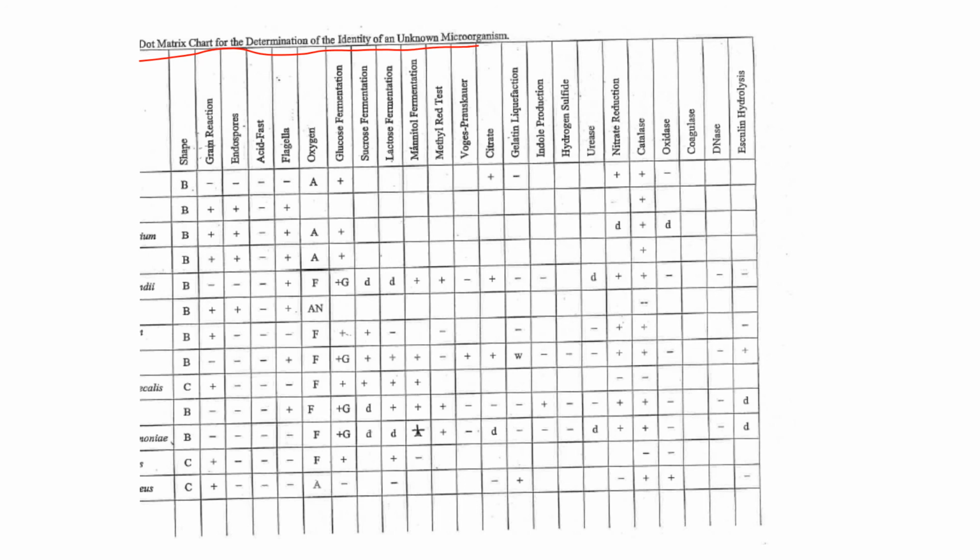This is uploaded onto Eagle, and you would compare your unknown's profile with known profiles. And I'm sorry here, but this has the names of the knowns, and in this copy, for some reason, they were cut off. But I just want to tell you in this matrix that, of course, a positive is a positive result, and a negative indicates negative for those results.